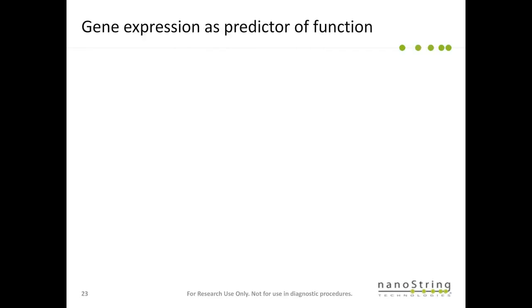So everything fits pretty well. The next question is, okay, now we have a data set where a lot of genes, in this case transcription factors, are studied, and we know some of them are upregulated, some of them can kill the mice around day 5 or 7, and those transcription factor mutants actually failed to do so.